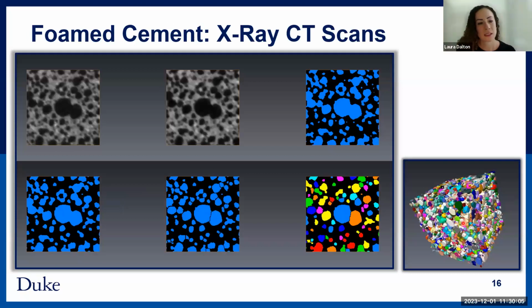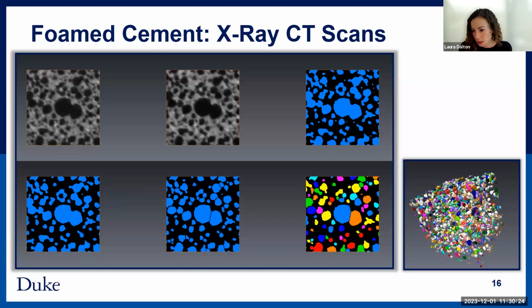And we can segment this out using image processing. There are many workflows from ImageJ, Pergeo, Aviso, Dragonfly, many really great softwares out there that are open source or commercialized. This happens to be in Aviso, but we can segment out pores and then characterize the porosity based on different sizes. We can segment out and really characterize what's going on with time.